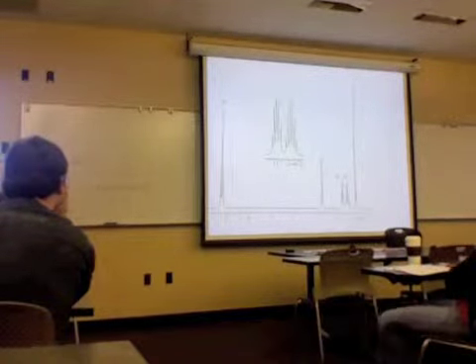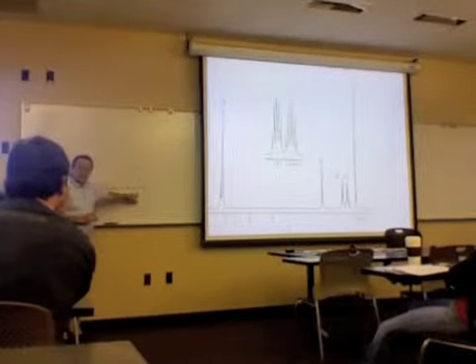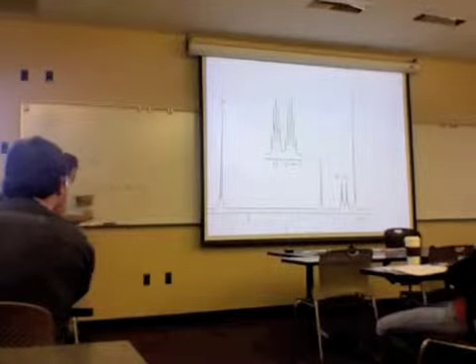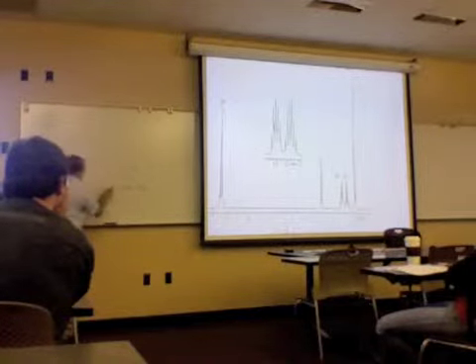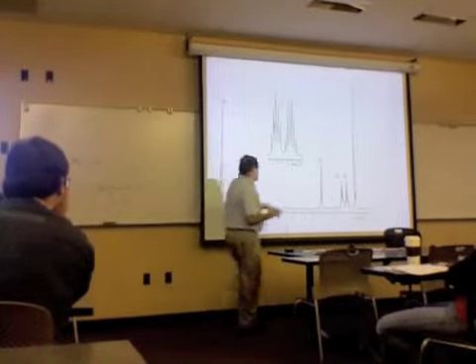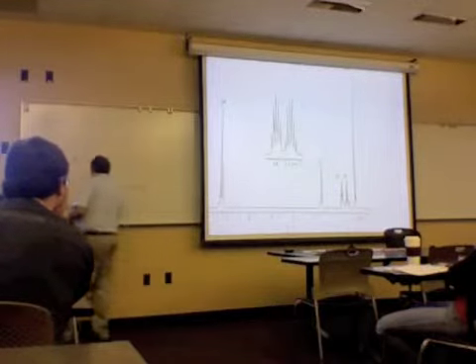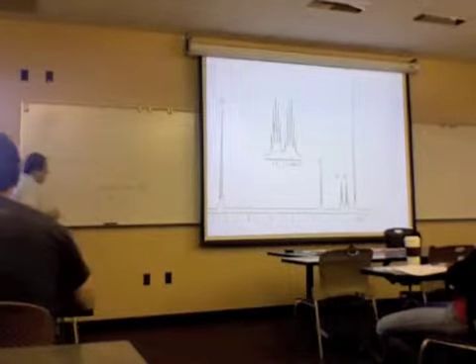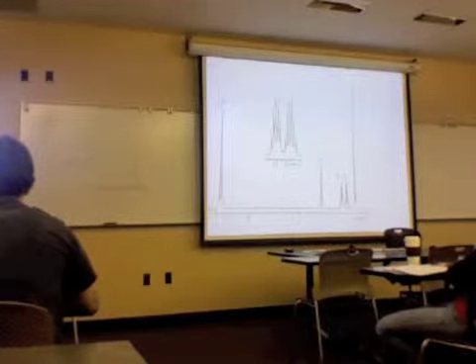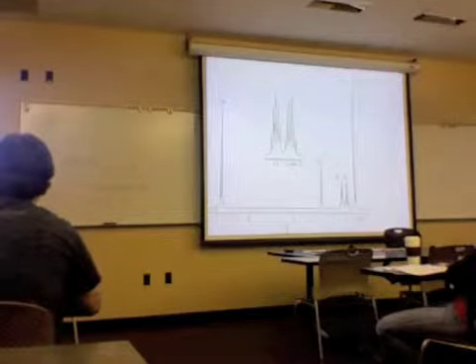And notice that this guy could be that guy. Does that make sense? Now this one here is split only by 2 hydrogen neighbors. This thing right here is a triplet and it's at about 2.6. So far, so good. I'm going through this kind of fast, but hopefully you're following what we're talking about.